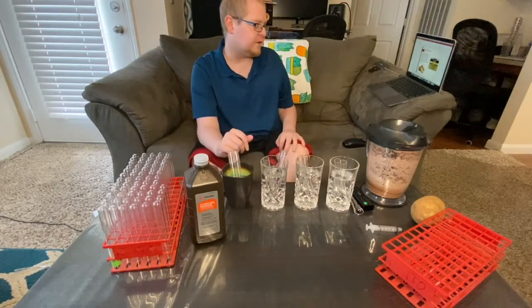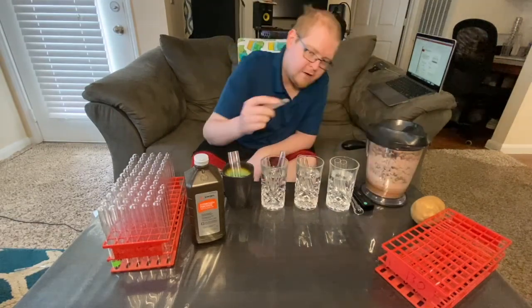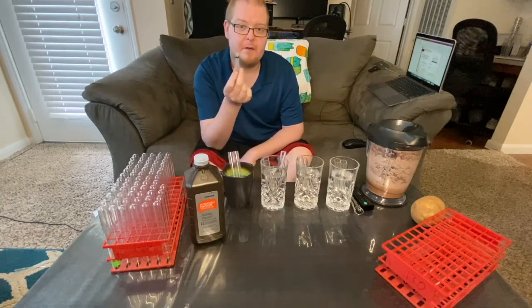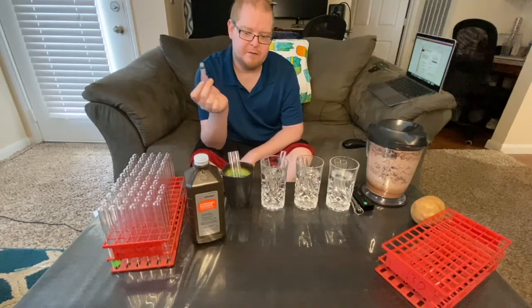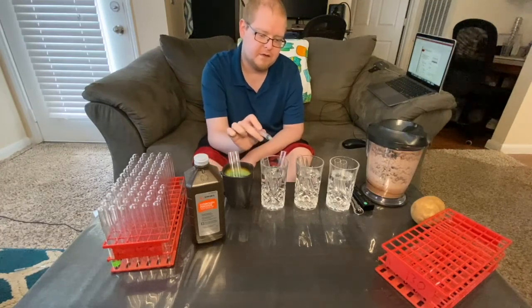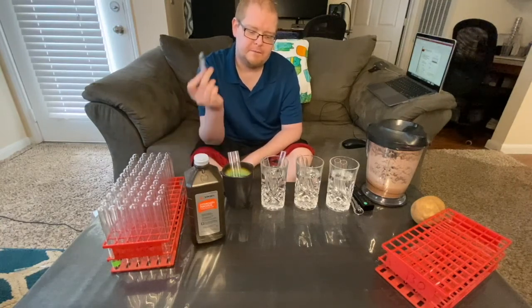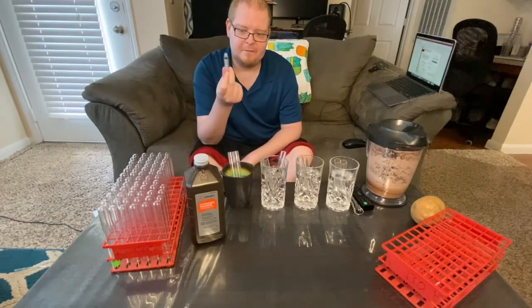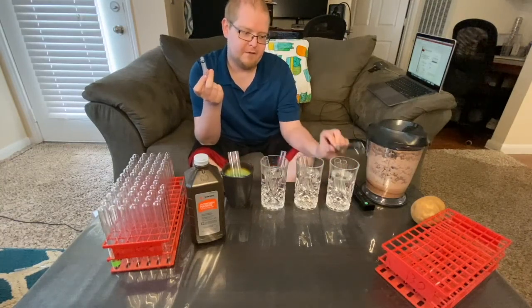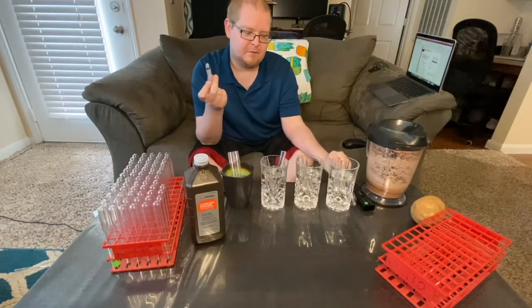What you're going to want to do, and this is what I did, I have a little syringe here, and I measured the exact amount, 5 milliliters of hydrogen peroxide, in each of these test tubes. Of course, you're not going to have exactly 5 milliliters, but you can use little measuring spoons.